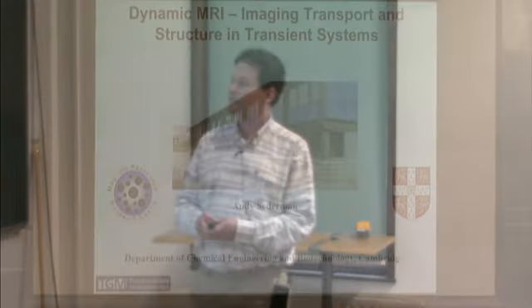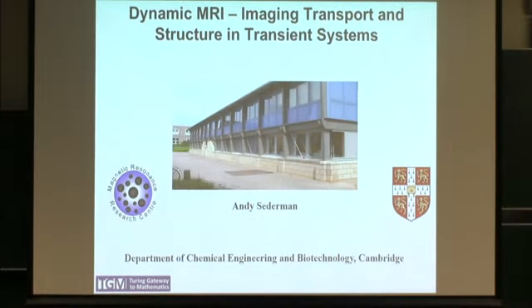So I shall also specifically be focusing on dynamic processes, say speeding up image times so that we can do a fast look at transient systems.